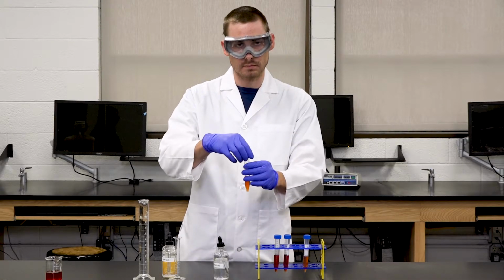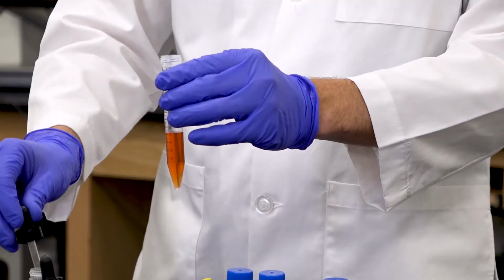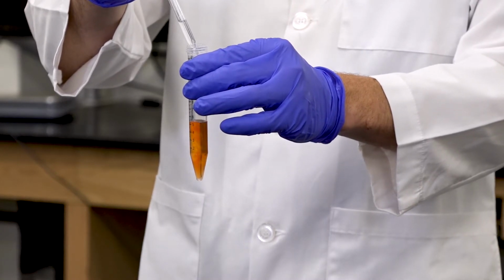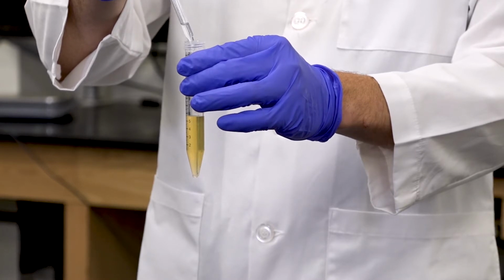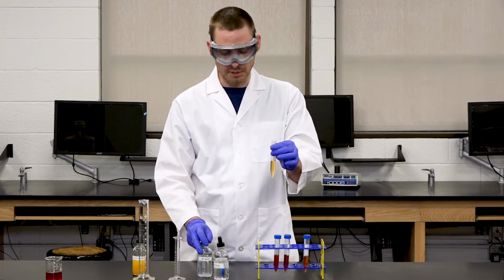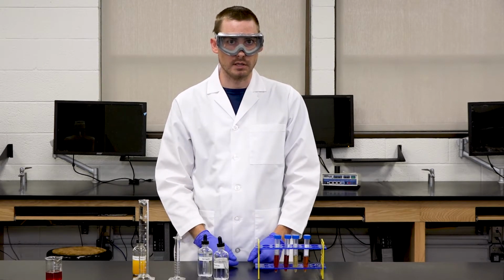To the third test tube that we have here, we're going to be adding 6 drops of 6 molar sodium hydroxide. The sodium hydroxide will react with the iron thiocyanate ion and will actually complex the iron and remove it from solution. Iron hydroxide is mostly insoluble in water, and so we would expect a precipitate to form at the bottom over time. The last test tube we will leave alone so that we can compare the colors of these 4 test tubes.